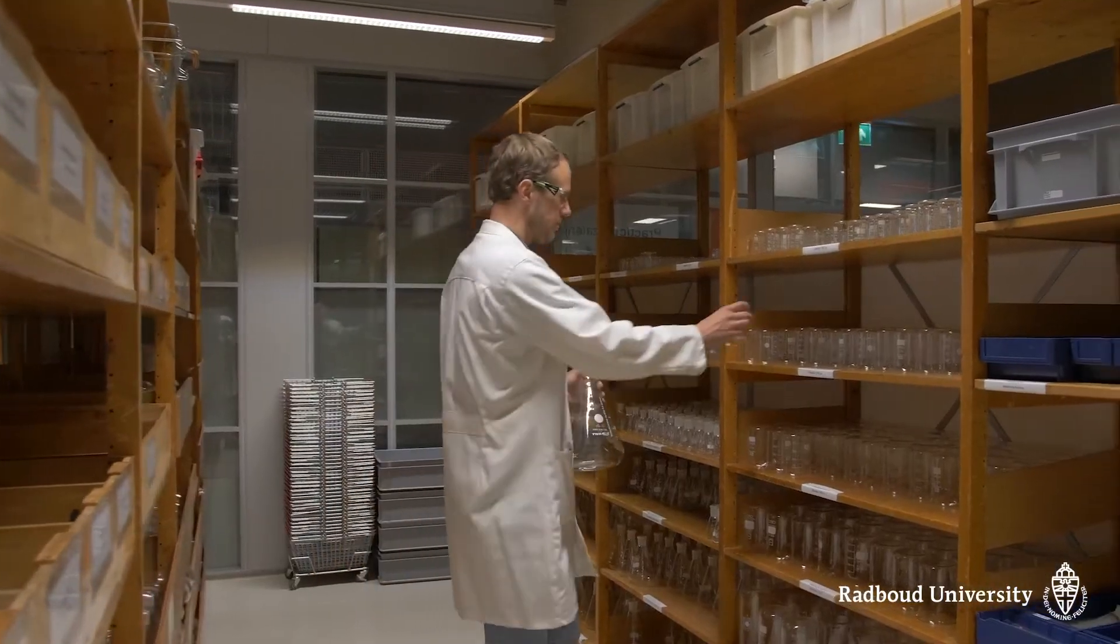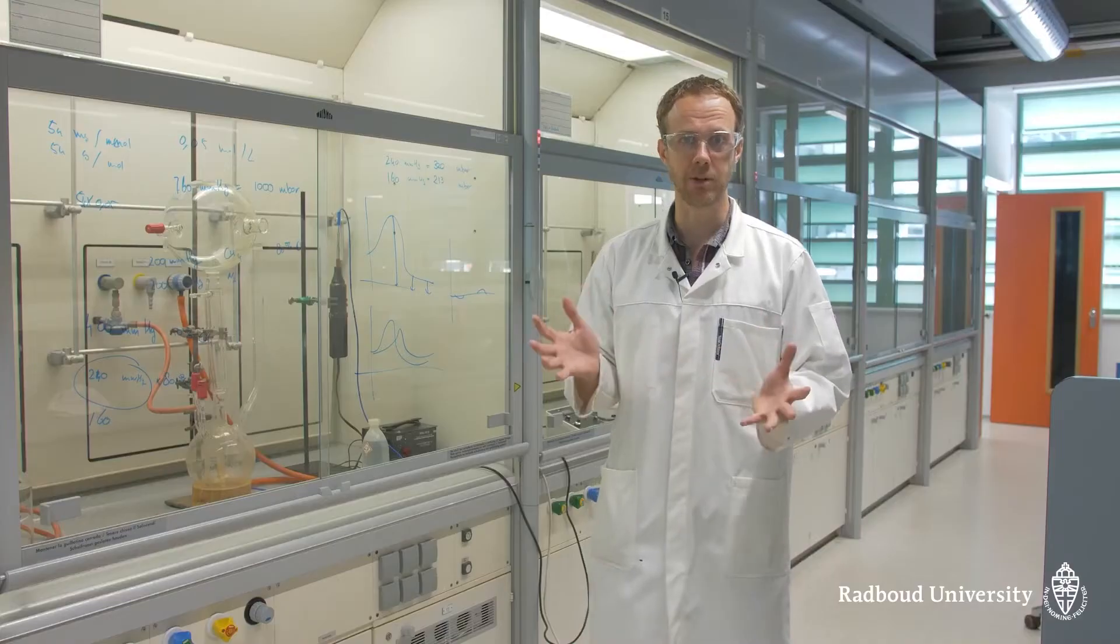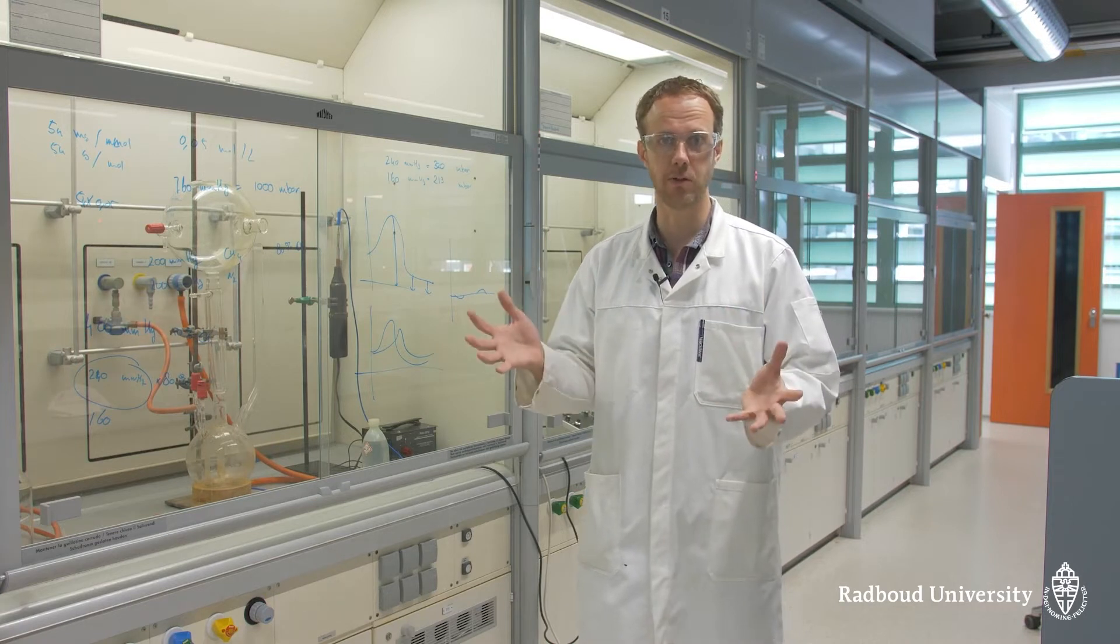In your first lab course, we focus on getting you and your fellow students at the same level. All our lab courses are connected to theory courses, so you apply what you learned in theory.